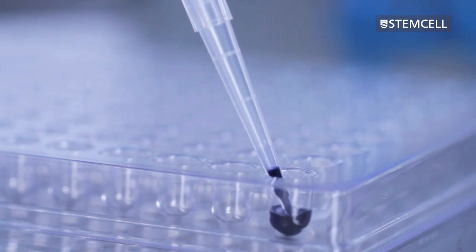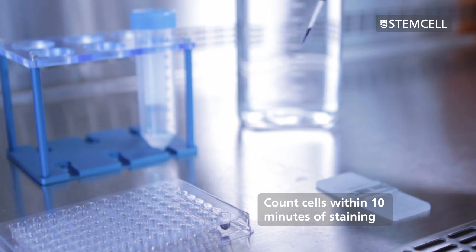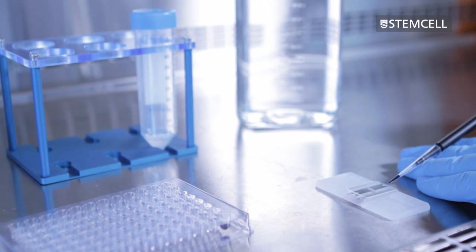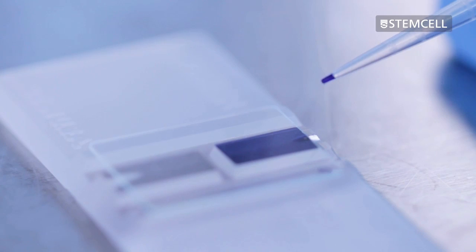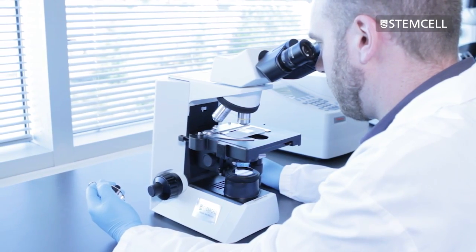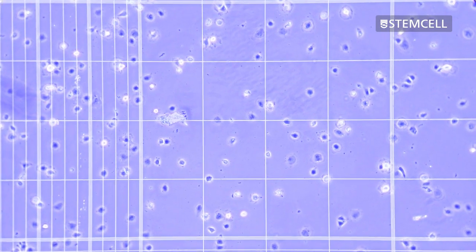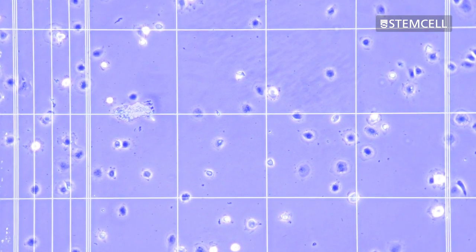Depending on the cell concentration of the starting sample, further dilution may be necessary. Cells should be counted within 10 minutes of staining, as Trypan Blue will nonspecifically label viable cells over time, resulting in inaccurate viability counts. Count the viable and non-viable cells separately using the same technique used for the total nucleated cell count. Stained dead cells will appear blue, while unstained live cells will appear white or clear.